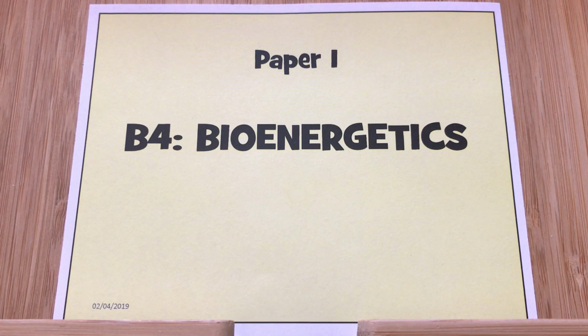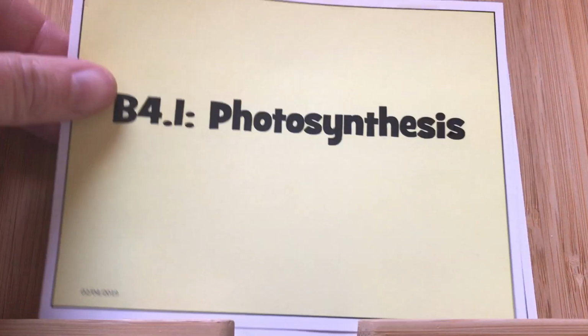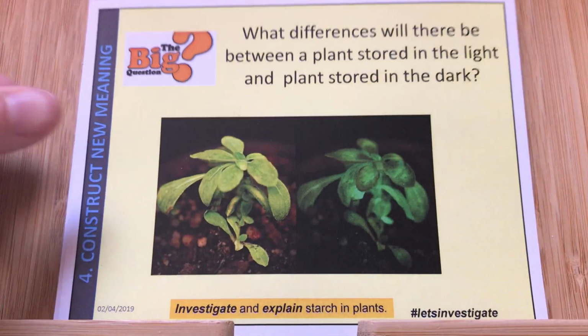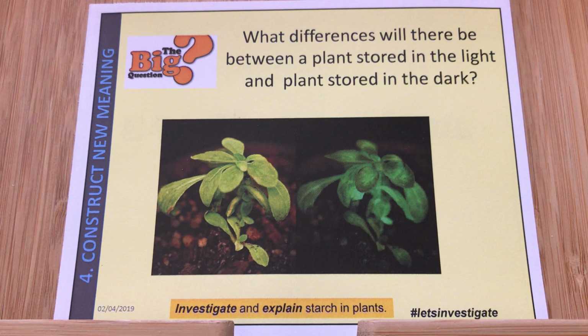This is a B4 video for the topic bioenergetics, looking at photosynthesis. And in this video we're going to be looking at the experiment where we compare the plant that's been in the light with the plant that's been in the dark in terms of the starch present in the plant.